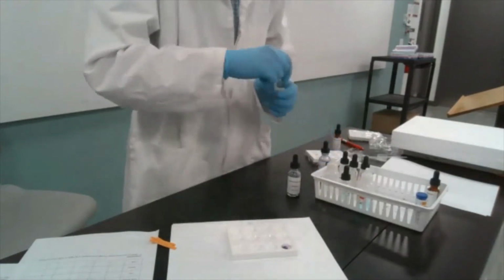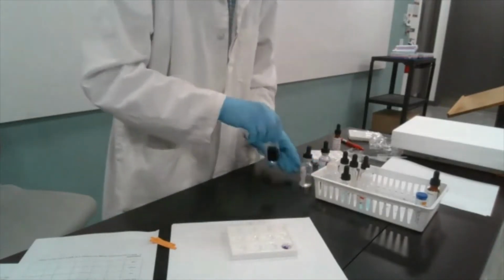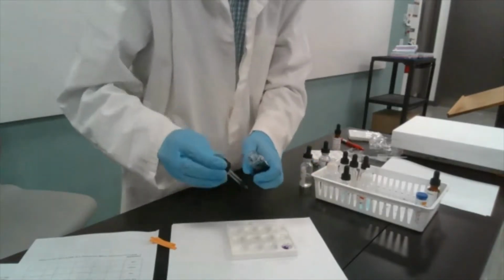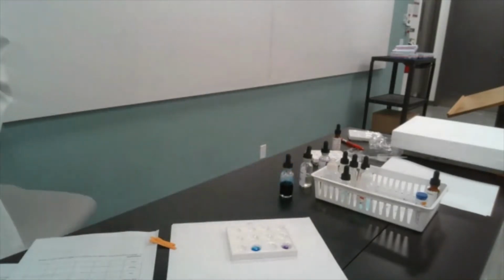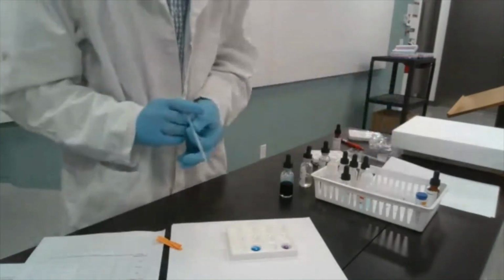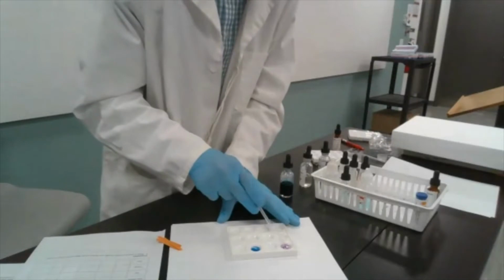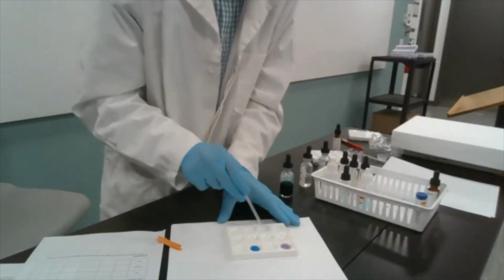Then I'm going to add phenolphthalein to the next one. And I'm going to add bromothymol blue. What I need here is something to stir it with, because this by itself does not provide for a very nice stirring. So hopefully you can see.